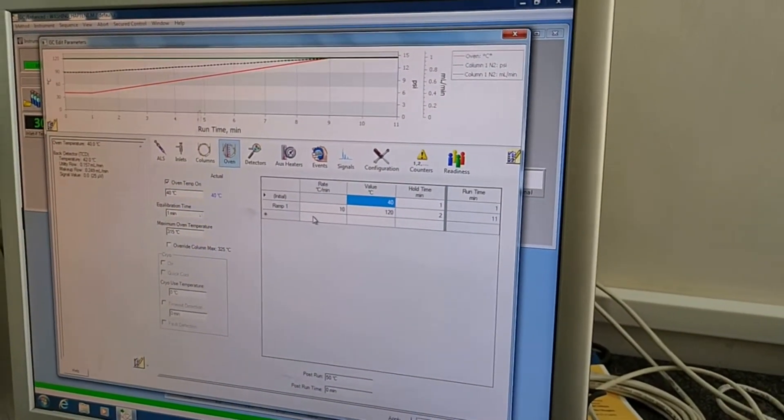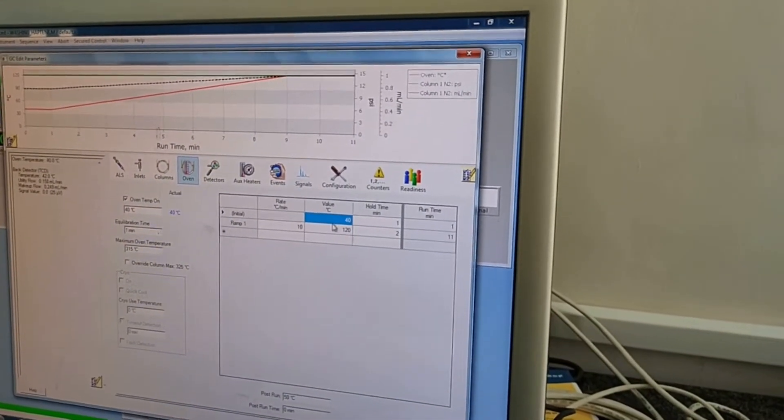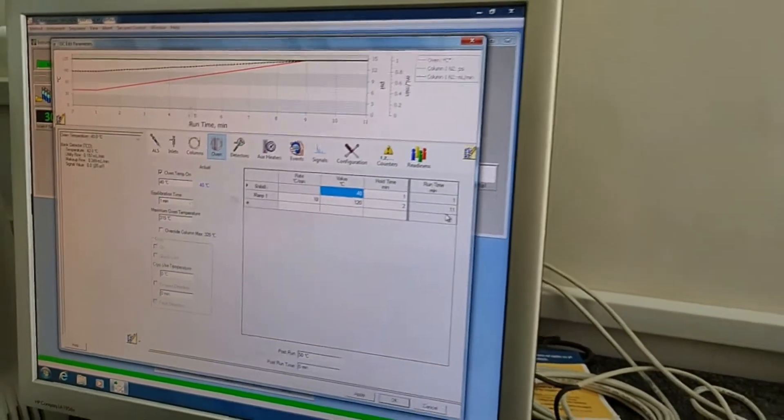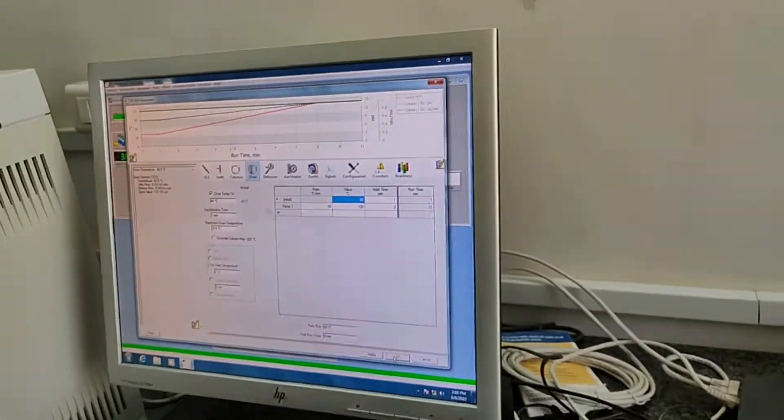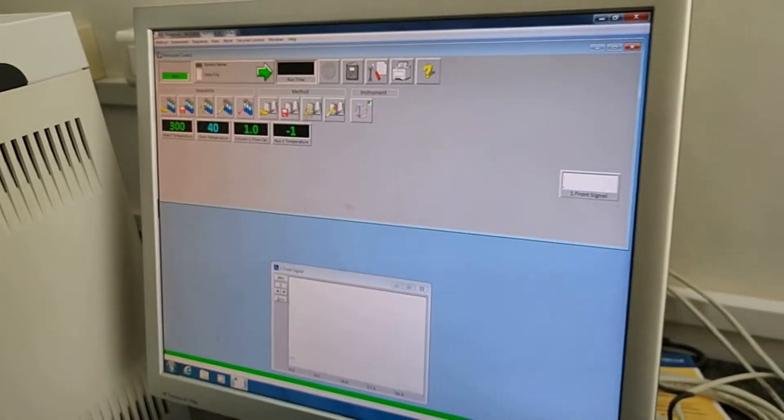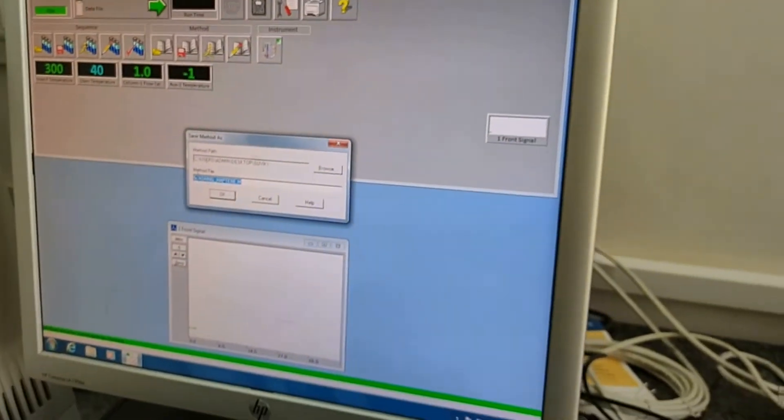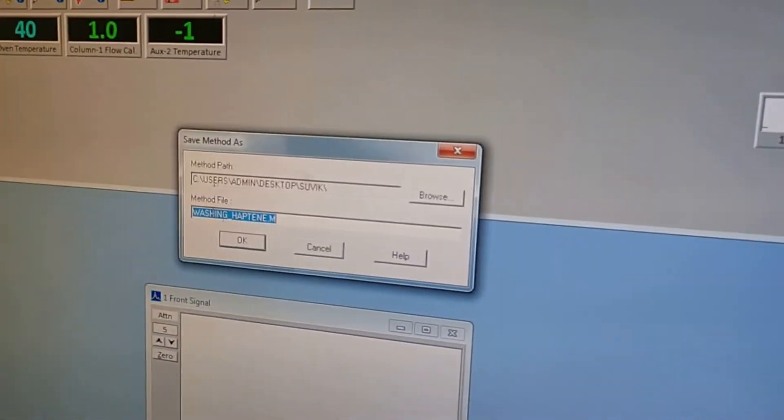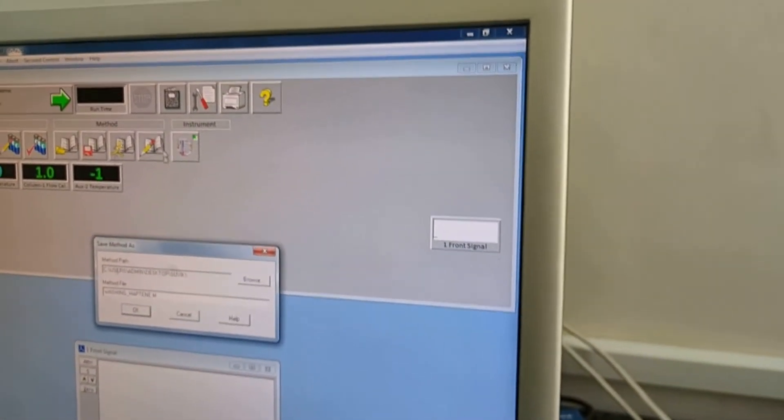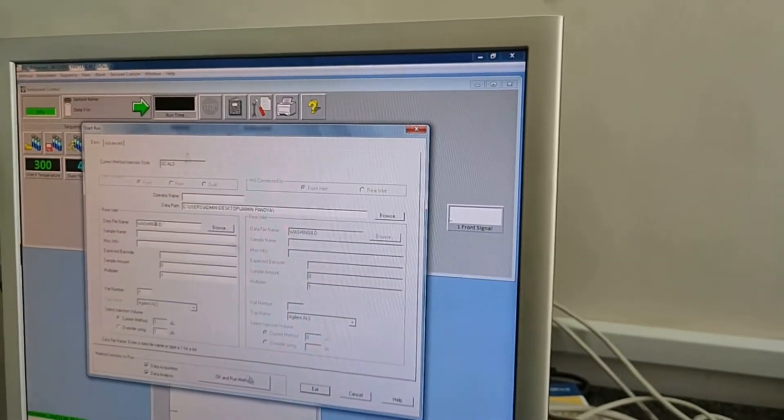So first of all here we are taking one sample. We are opening initially the temperature is 40 degrees and detected around 120 degrees Celsius. We can run that. The total running time of our program is 11 minutes. Then after click on OK. After that when you have completed the method detector, then after click on Run. You show the name of the file, method file. You can change this if you change the name. Now click on OK. Given the file name. Then after click on OK.